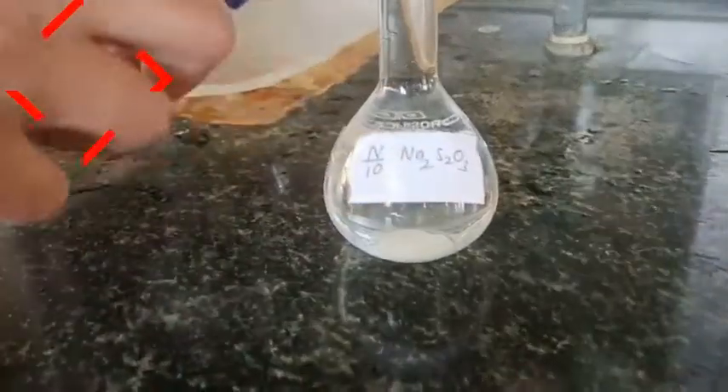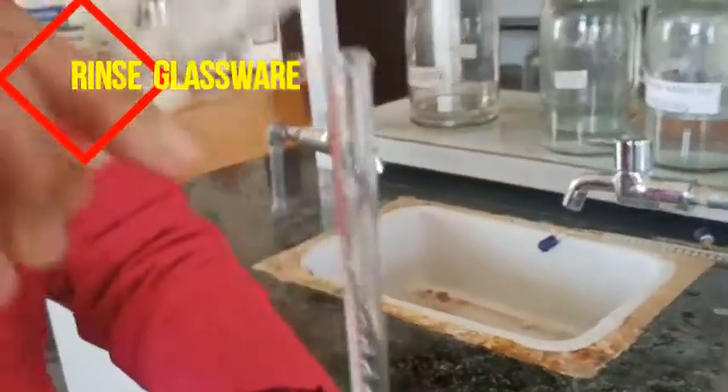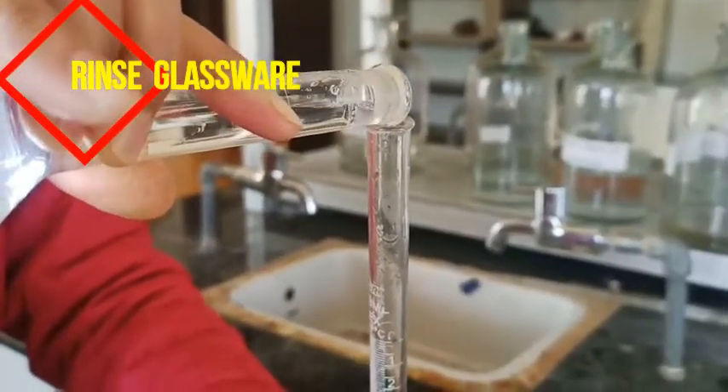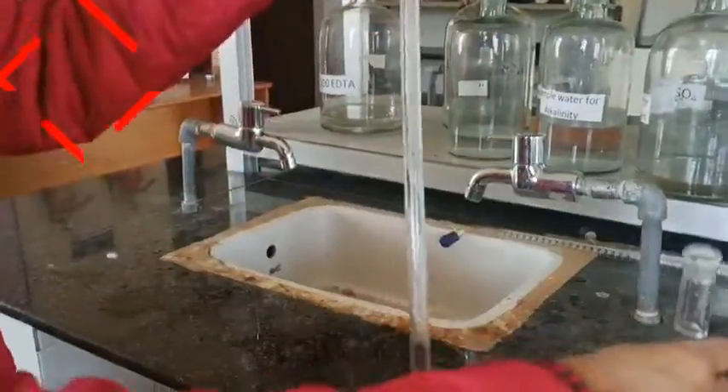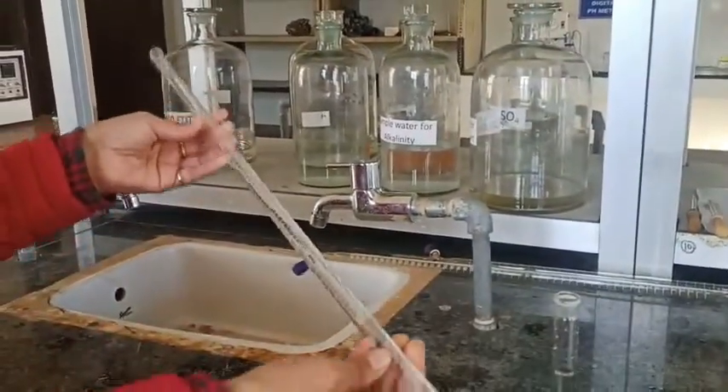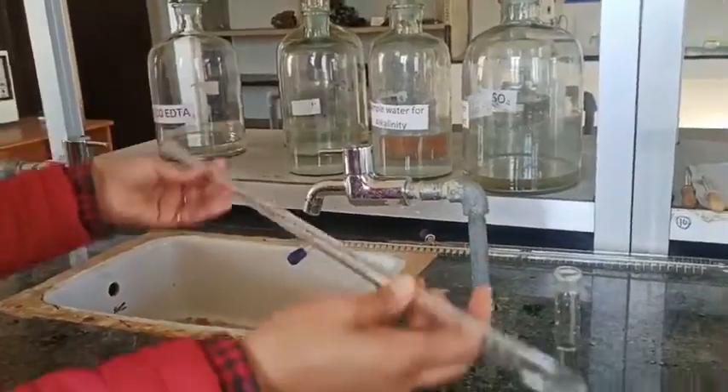Now we are going to rinse the glassware because we are standardizing — every piece of glassware should be washed and rinsed thoroughly before use. In the burette I am going to fill the sodium thiosulphate solution, so I am rinsing it with sodium thiosulphate solution.